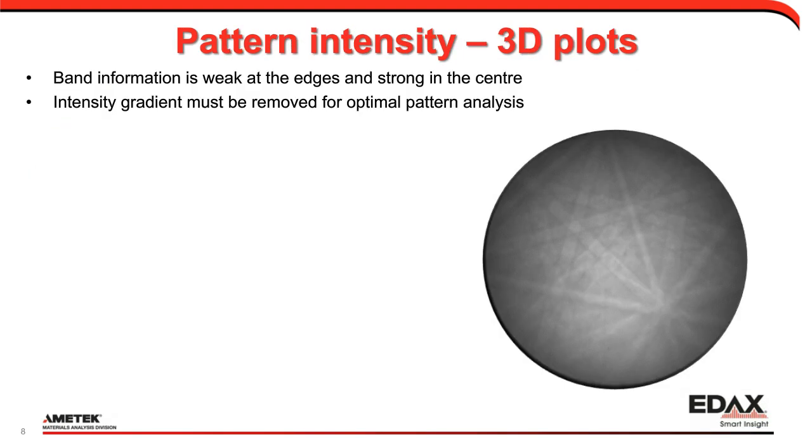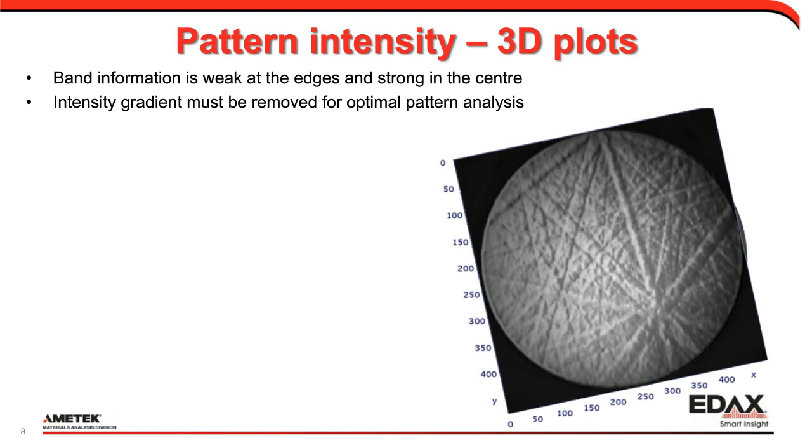So what we can do with this is essentially remove the background on top of it and get a lovely pattern off of this. That's why we're doing this: we're trying to increase the contrast, and let the Hough do its job better. So with that, we go ahead and actually look at what this pattern looks like in 3 dimensions. And I think this is a neat way of looking at your data. So here's the pattern. Let's look at it background corrected.